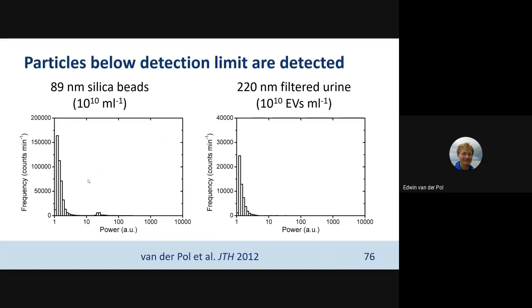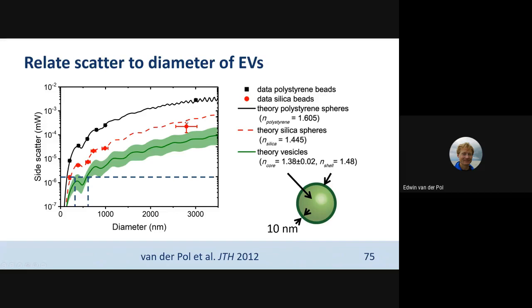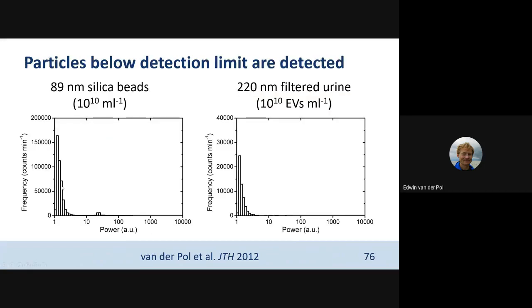Particles below the detection limit were somehow also detected with this flow cytometer — an effect we didn't anticipate. For example, if we took 89 nanometer silica beads, we didn't expect any signal from those, but we detected some power from them. The same happened for urine vesicles which we filtered so that large vesicles were gone and only vesicles smaller than 220 nanometers were left — we also got some signal, and that was more than the background we got from water.